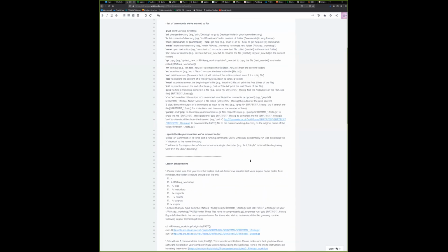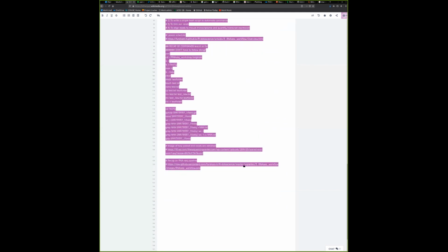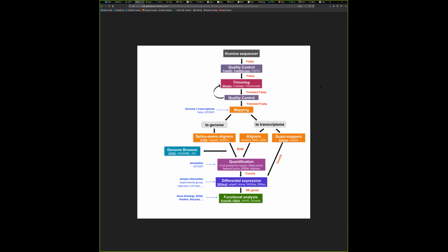And then when you have these sequences, you can input them into the pipeline. So I'm going to show you the pipeline again from last week. We were somewhere around here. We looked at how the output of a sequencing experiment looks, how the reads look. It's actually like a FASTA file. If you're familiar with FASTA format, it has a name, an ID. Usually, a FASTA file starts with a greater-than sign, but this FASTQ file uses an @ sign to begin the name of a sequence, followed by the sequence itself and some quality information.